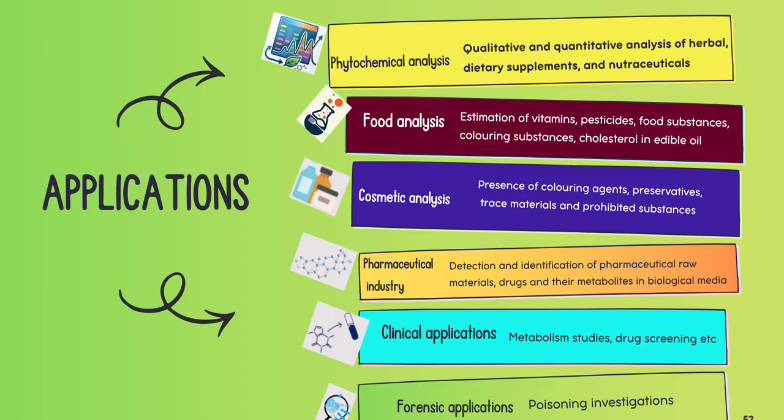The advantages of HPTLC: it is a simple and rapid technique and requires relatively low solvent consumption. Multiple samples can be analyzed simultaneously. It is suitable for herbal extracts, provides both qualitative and quantitative analysis, requires relatively small sample volume, and is useful for getting fingerprints. It allows visual documentation of all the compounds and is useful for batch to batch studies.